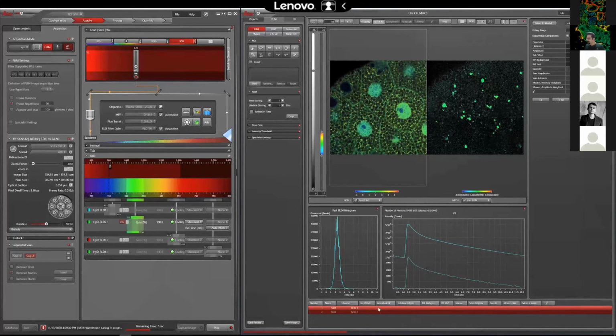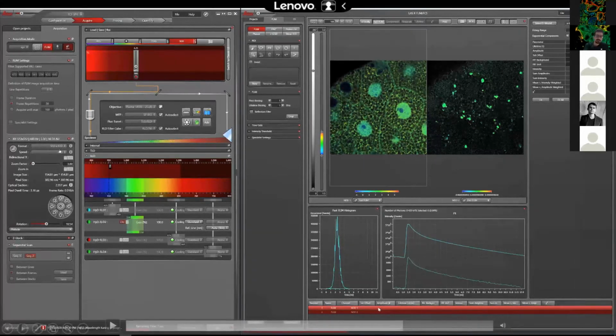I think it was worth more than 5 cents. And yes, that's true, we can do the binning. It can be done while we are acquiring the images, using larger pixels. I can choose a different zoom factor and a different number of pixels. If I change the field of view from 512 to 256 by 256, then the pixel size would be 2 times larger, which would be equal to a binning of 2.